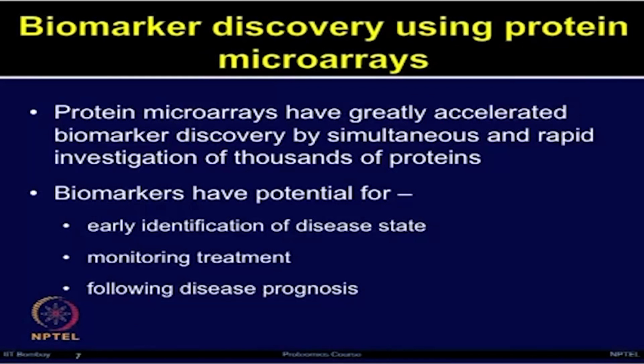Protein microarrays have greatly enhanced the biomarker discovery process because they allow a high throughput platform for simultaneous and rapid screening of thousands of proteins. Many times the clinical samples are a limiting factor because you do not have a large amount of clinical sample to perform a study. In that regard also, the protein microarray is very impressive because with a few microliters of sample one can screen thousands of protein features simultaneously on the same platform.